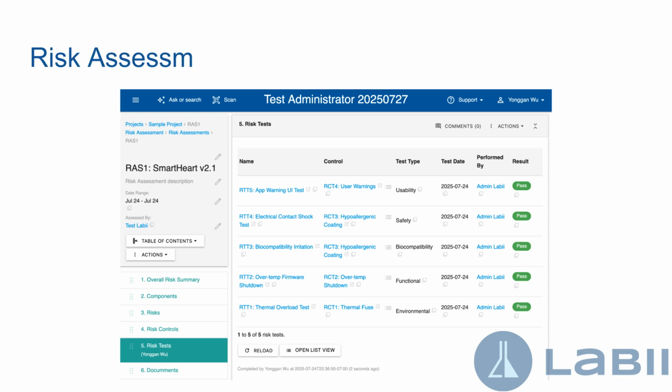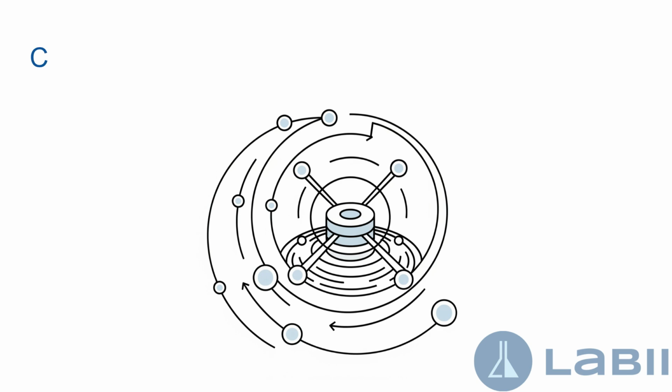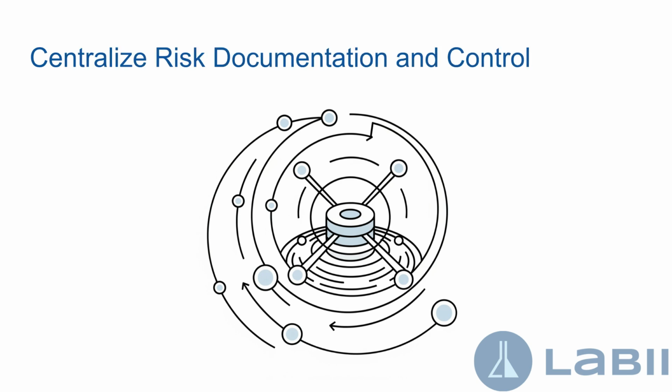Labii Risk Assessment empowers research, manufacturing, and compliance teams to identify, evaluate, and mitigate risks with precision. Built for life sciences, pharmaceuticals, and other regulated industries, Labii makes risk management a structured, auditable, and repeatable process. No spreadsheets required. Centralized risk documentation and control.